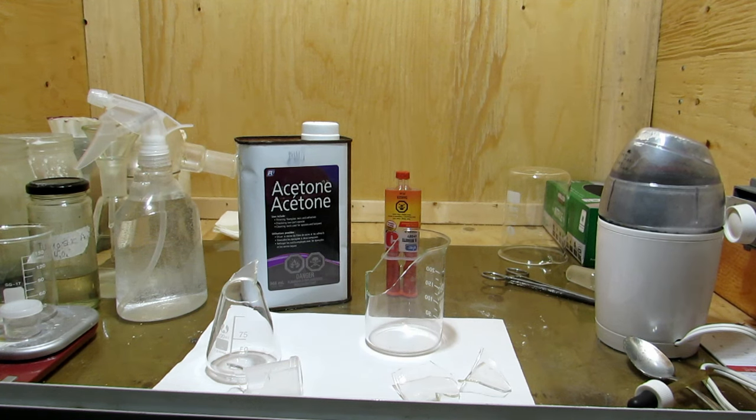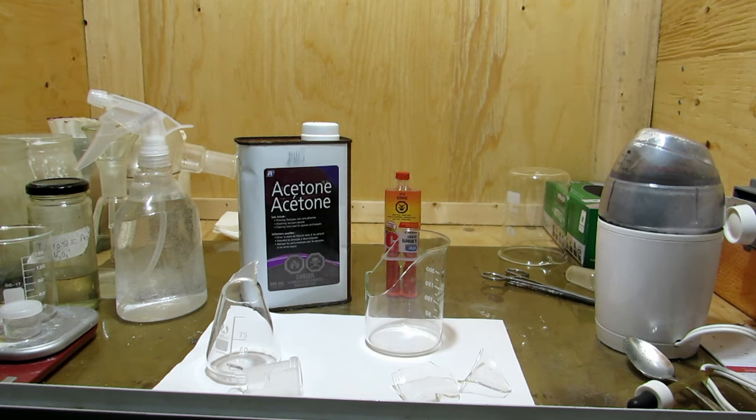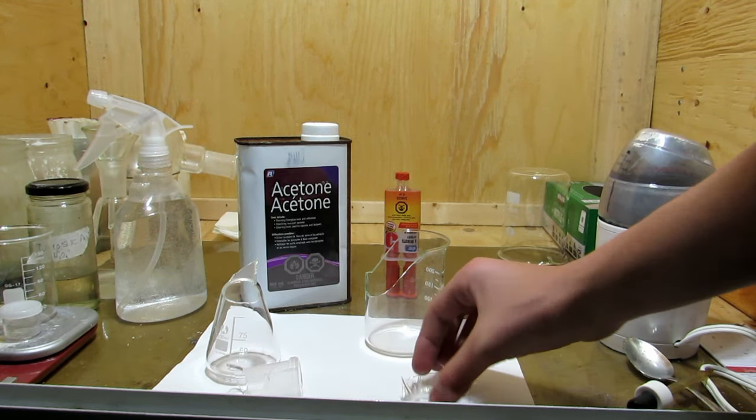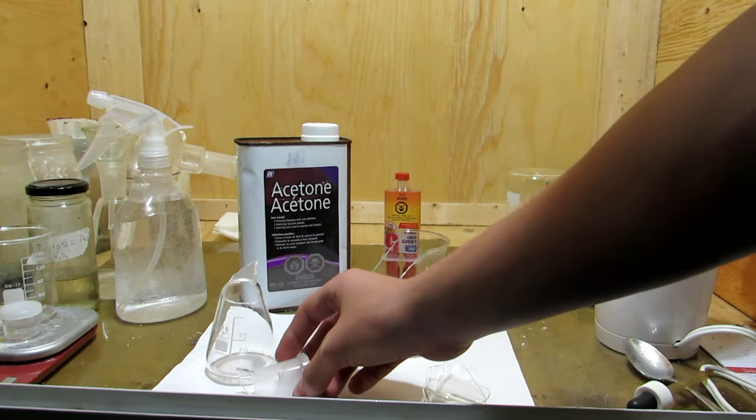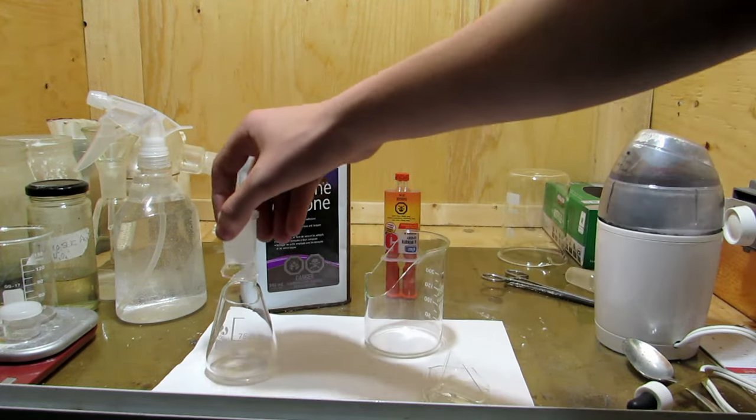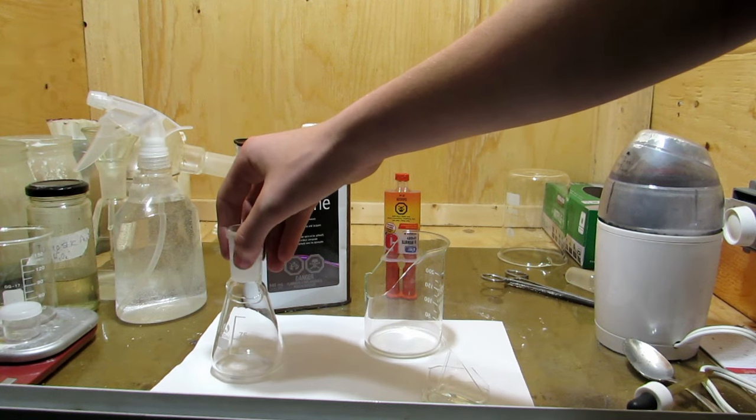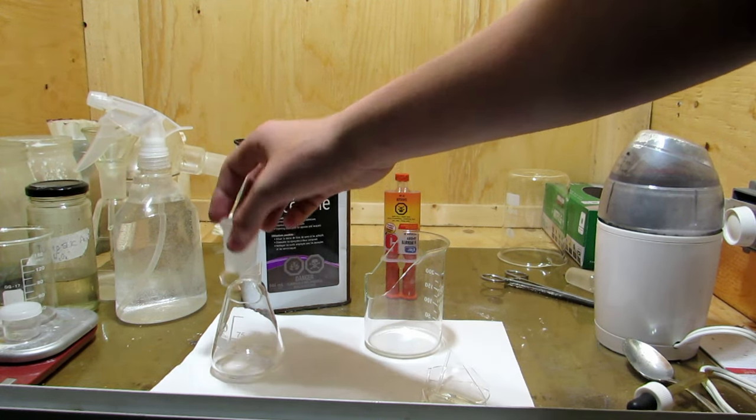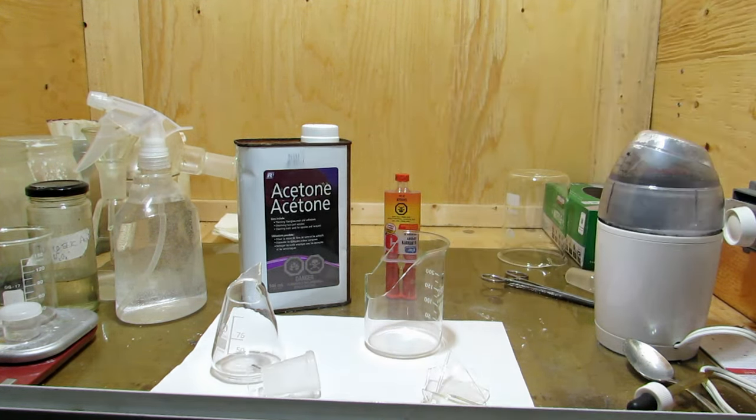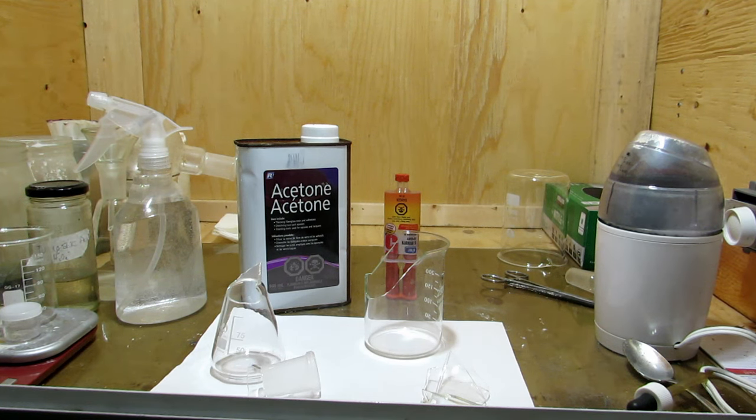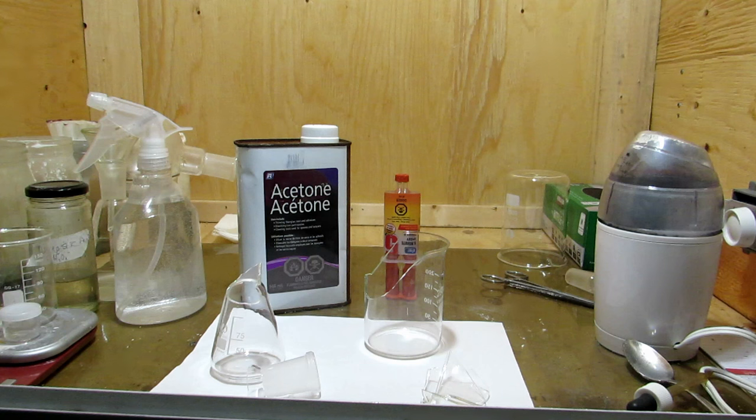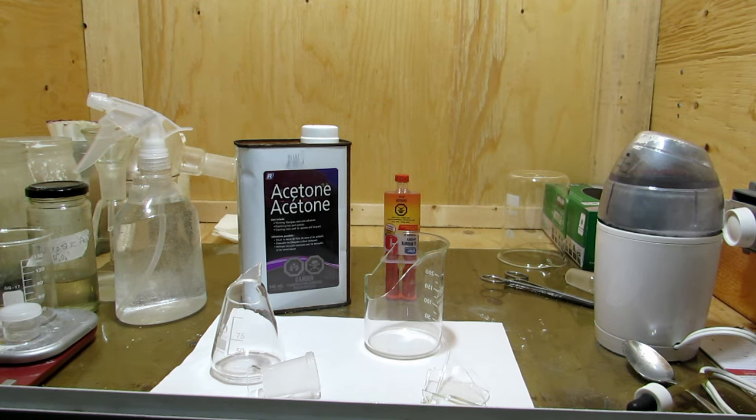Sometimes glassware totally shatters and you must throw it out, but other times it breaks into two or three pieces, or maybe even one piece, and you can still fit it back together. However, the problem is you can't just let it sit there because it's not connected. You could take a propane torch to this and heat it up, but that typically warps the glass, and I find it causes it to crack most of the time, and it just doesn't work very well.